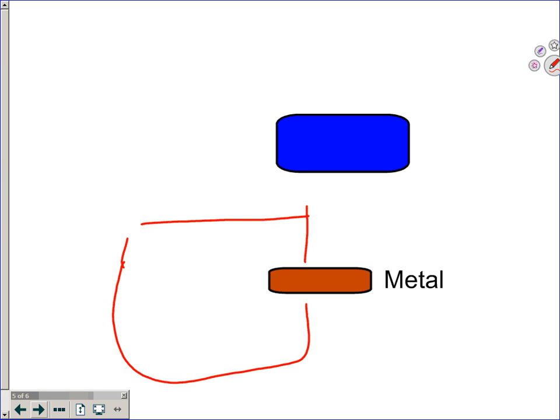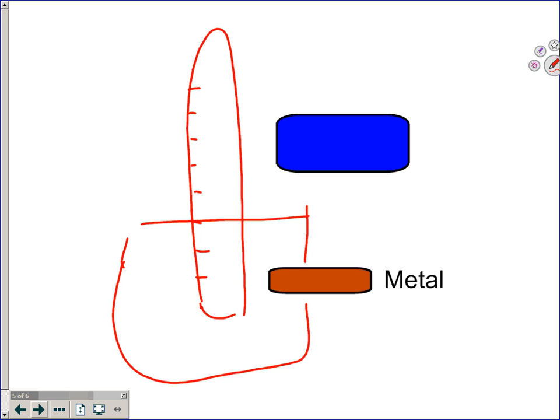Okay, and then you had a eudiometer tube, and the eudiometer tube has these graduations on it, and you're going to have a stopper in the eudiometer tube, but the stopper is a one-hole stopper, so it has a hole in the bottom of it, and you're going to tie a string, thread it through the hole, and your little piece of metal is going to be floating in the inverted eudiometer tube. So your piece of metal will then react with the acid, and there's water in here too, but the acid that we put inside of our eudiometer tube.